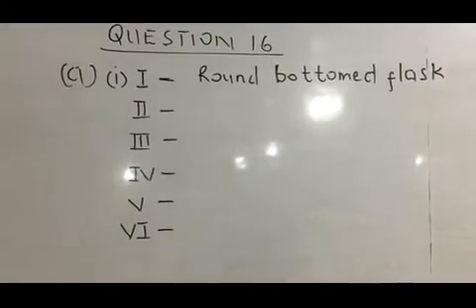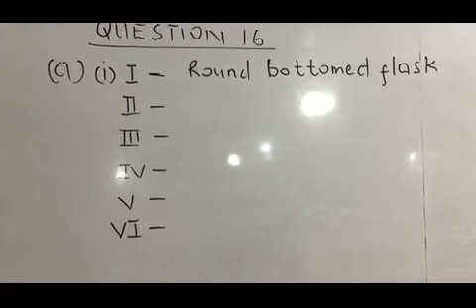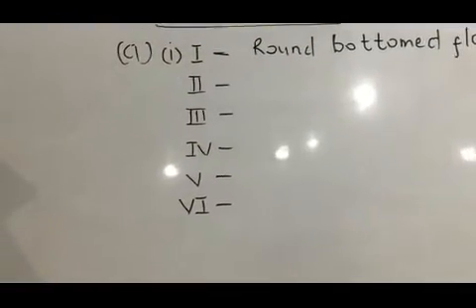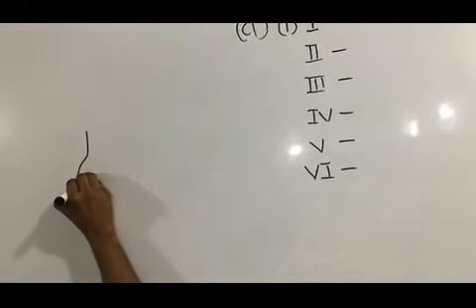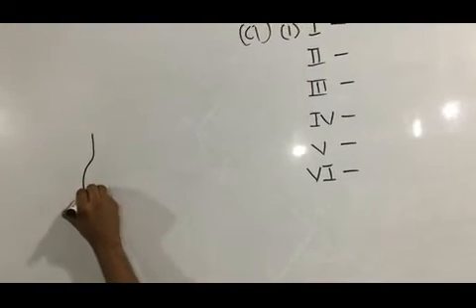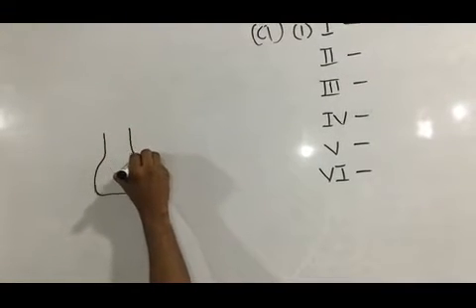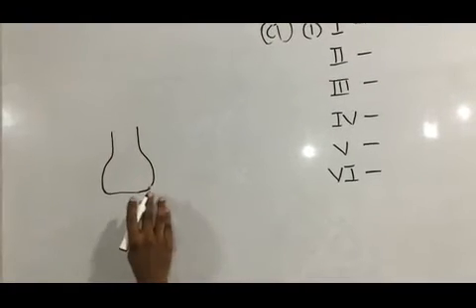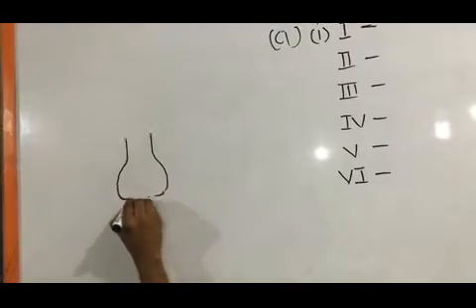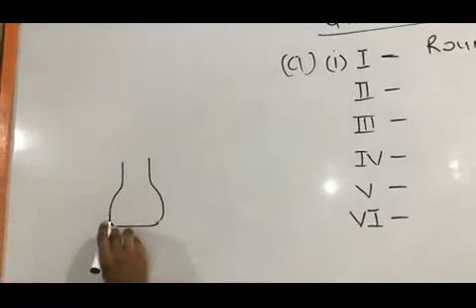If you look at the previous questions we've solved, we've come across the flat bottom flask, which has a flat base.